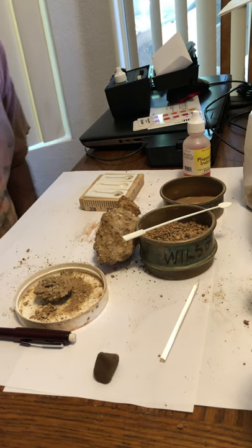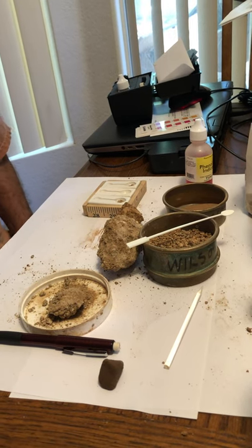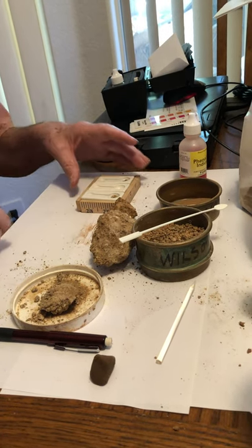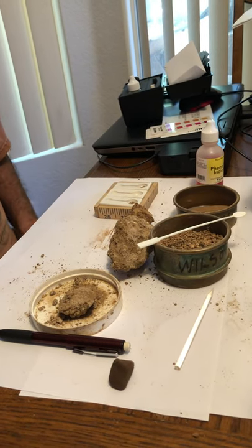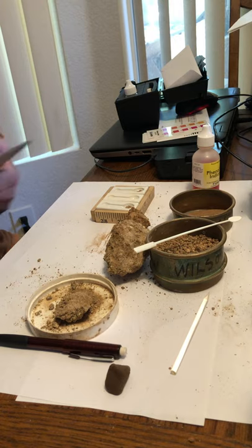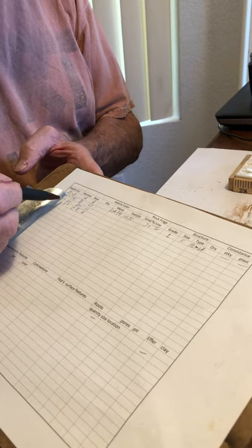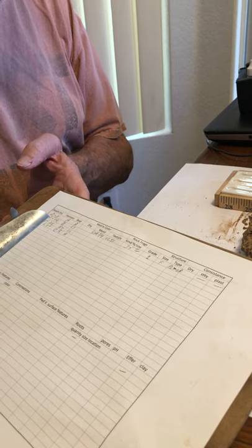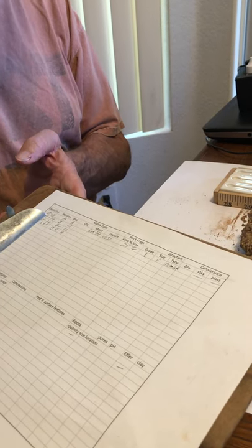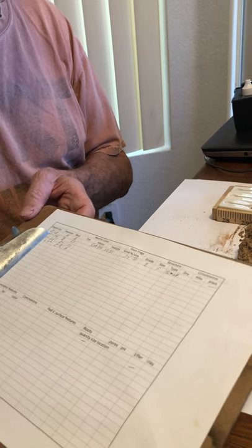We're back at the laboratory, out of the heat and the sun. What I want to demonstrate right now is how you do pH. If you remember at the pit, we had four horizons: zero to four, four to fourteen, fourteen to twenty-eight, and twenty-eight plus. This is the form that we use to record our data, and I'll go ahead and get it all filled out and send that as a separate video.